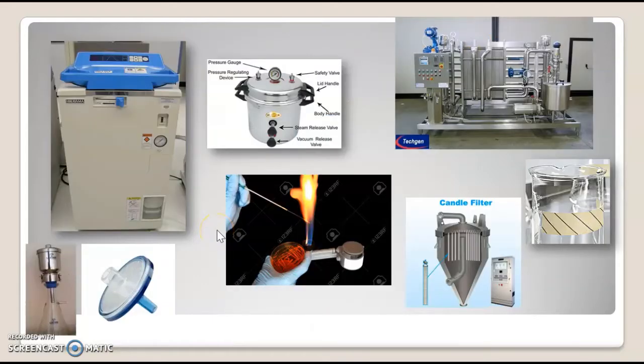Moving on to the apparatus that you will be using in a microbiology lab. The apparatus could be, for example, glassware, petri dishes, nutrient broth, nutrient agar, or an inoculation loop. These apparatus must be sterilized. How do you actually sterilize most laboratory apparatus?